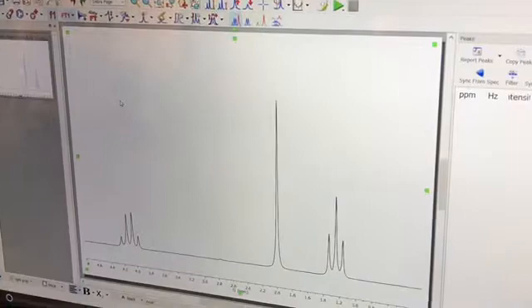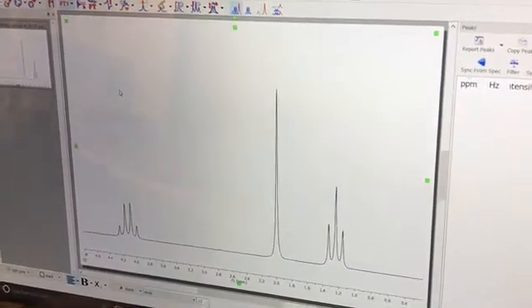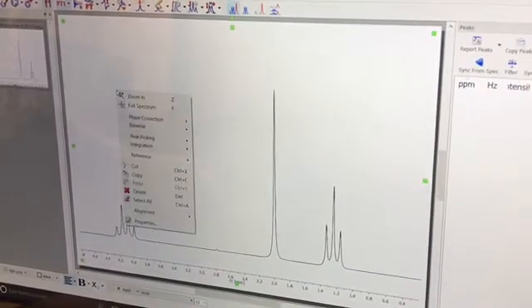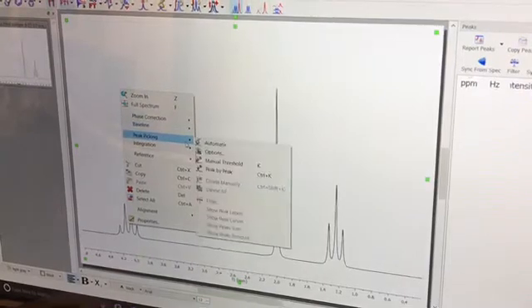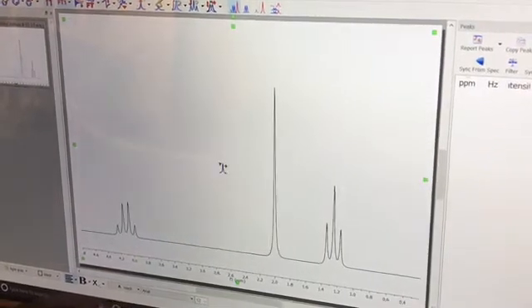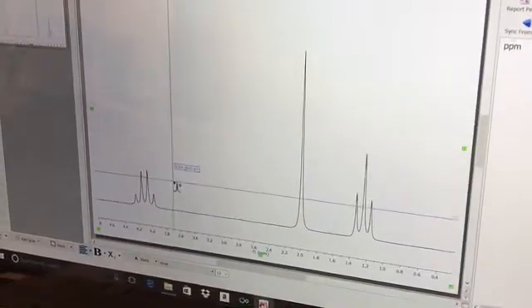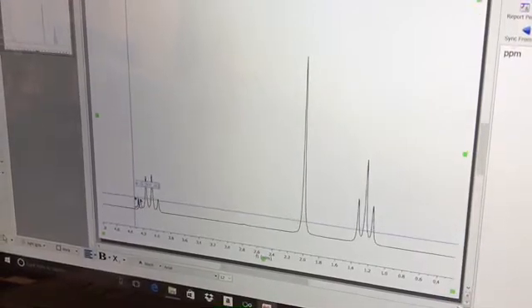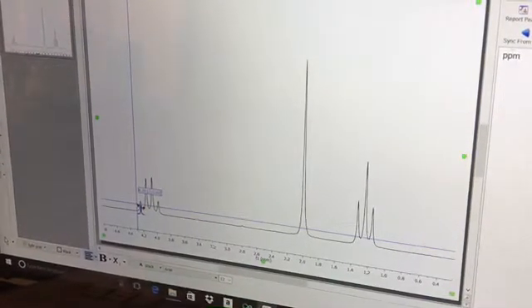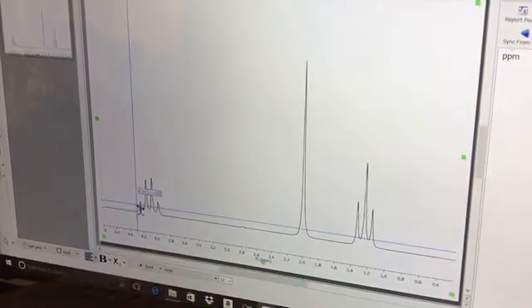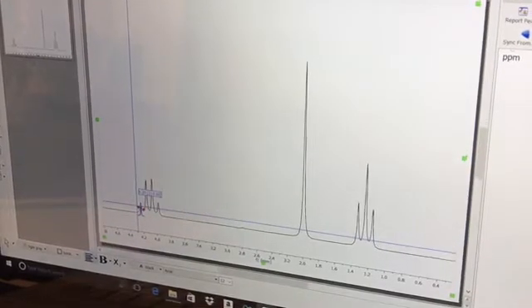The first things you want to do to analyze your data is right-click, go down to Peak Picking, and select Manual Threshold. You're going to place the crosshairs to the left and a little bit below the leftmost peak.